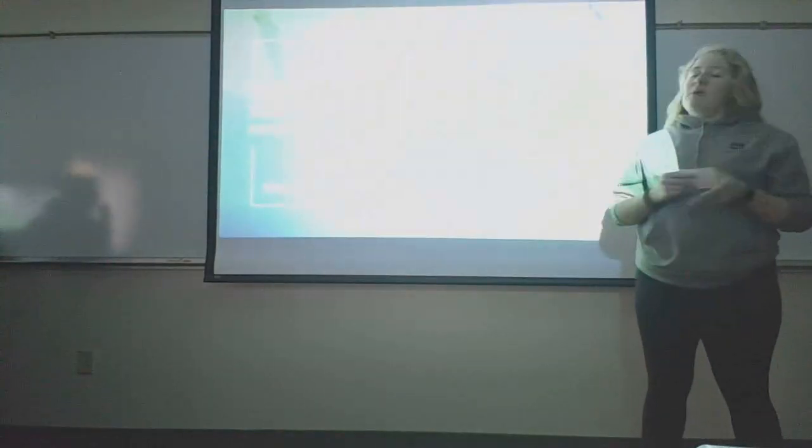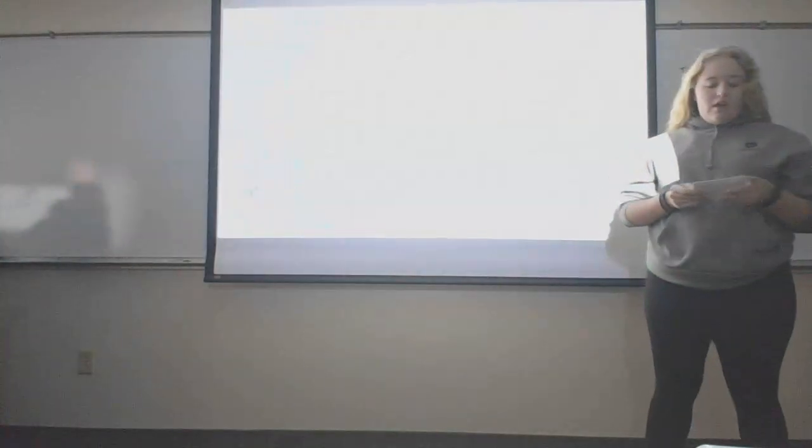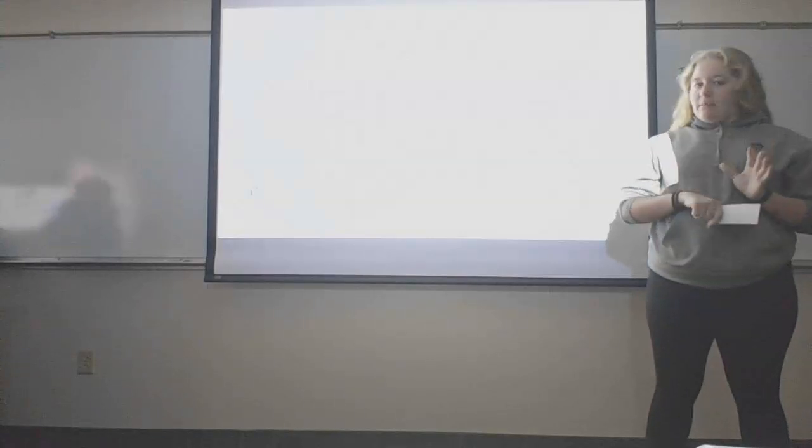All right, so this is experiment 1, or a presentation, "What's in the water?" To start the experiment, we first had to develop an understanding of IR and NMR.